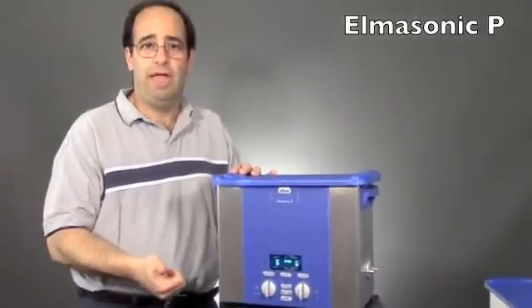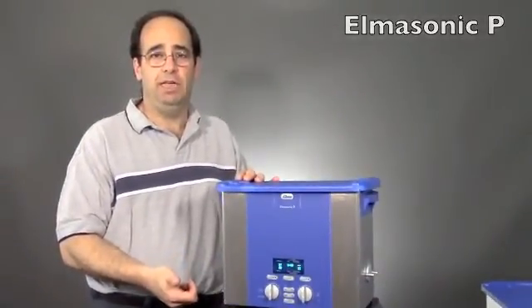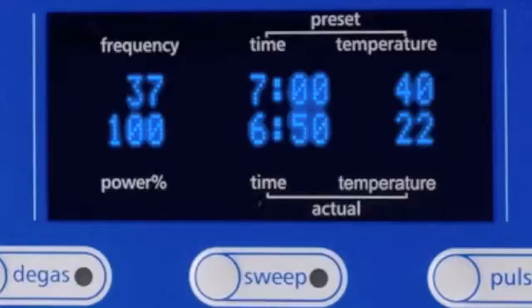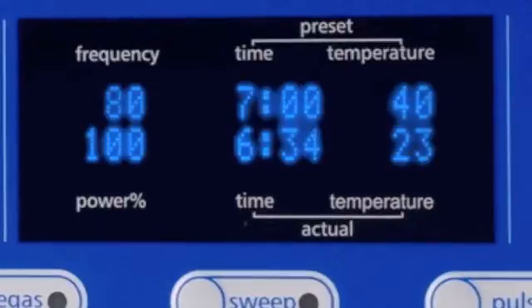The P line also has multi-frequency capability, so you can run at 37 kilohertz, which is your typical regular cleaning mode, but it also runs at 80 kilohertz, producing smaller bubbles, and the operation is virtually silent.